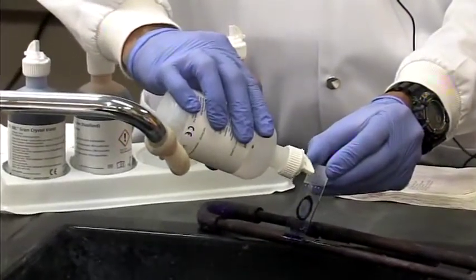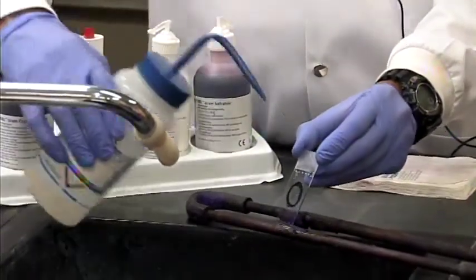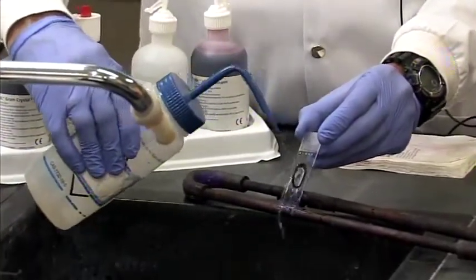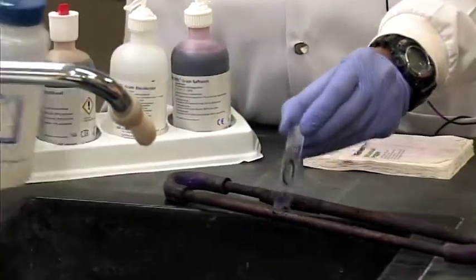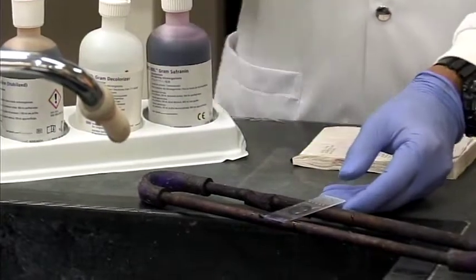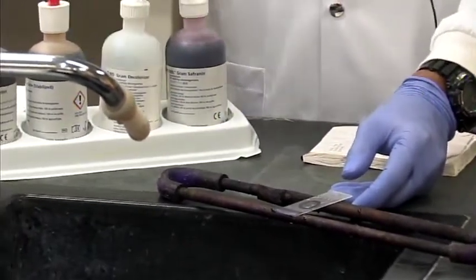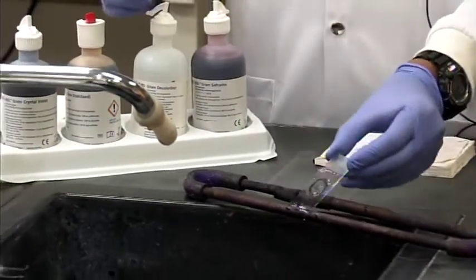Once the blue color stops coming off and it runs clear, you stop, and you quickly apply some distilled water around the smear again to stop that decolorizing process. The reason why you have to move very quickly is because you can over-decolorize a smear by adding too much decolorizer and forcing that color out. So now we are at the third stage.